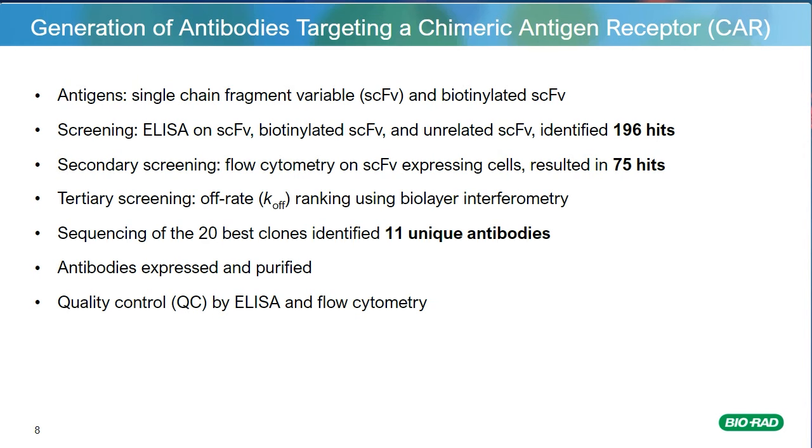The unbiotinylated antigens could be used for a solid phase panning, where they're coated directly to a plate, whereas the biotinylated format can be used in semi-solution phase panning, where they are coupled to a streptavidin-coated bead.